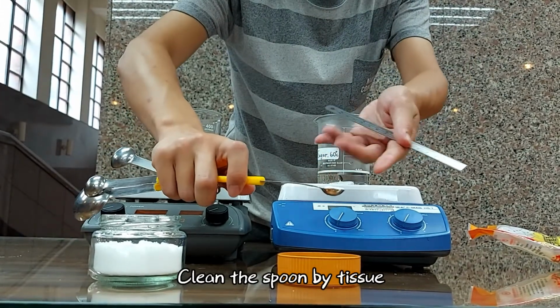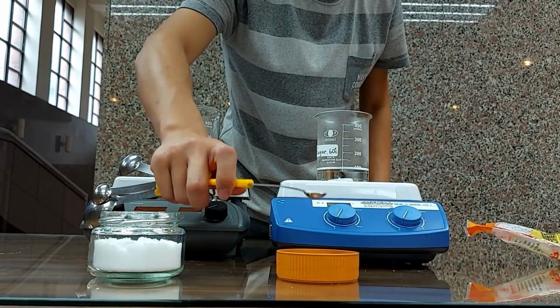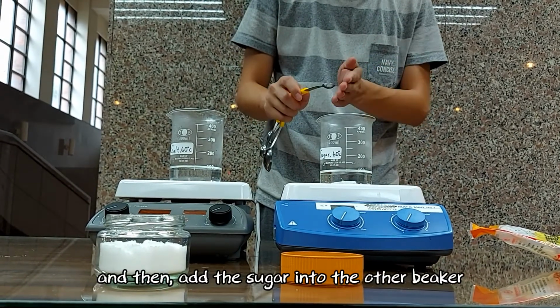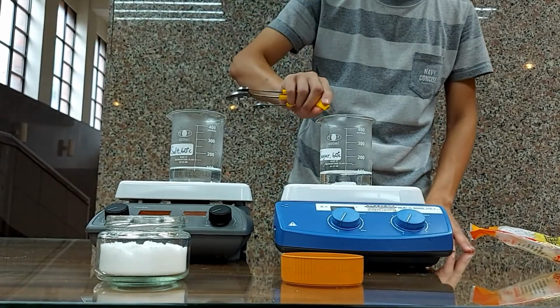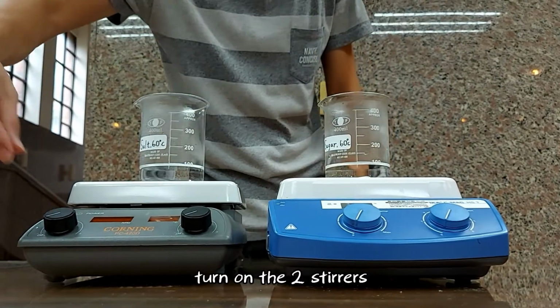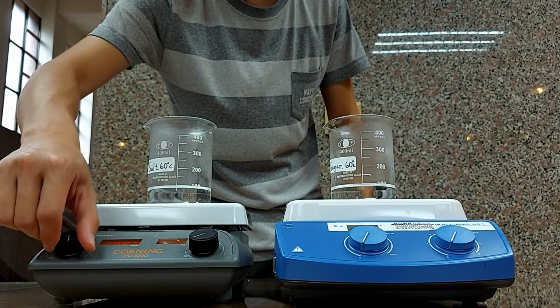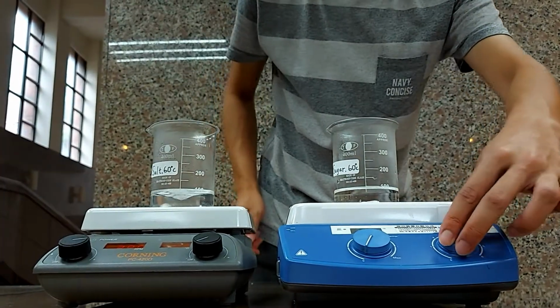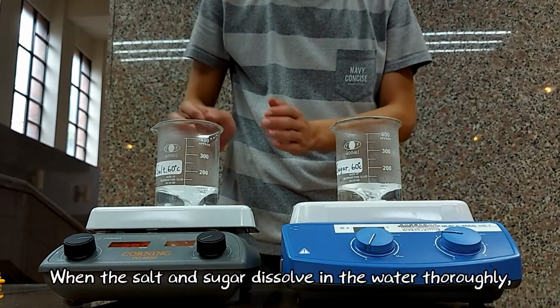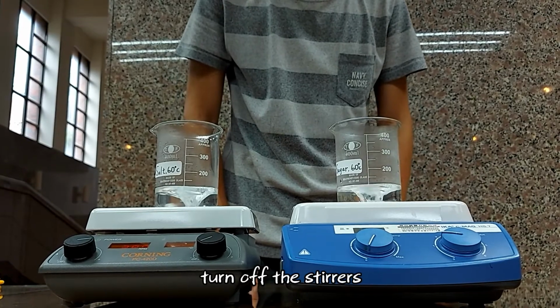Clean the spoon with tissue and use the same way to make one level teaspoon of sugar. And then, add the sugar into the other beaker. Turn on the two stirrers. When the salt and the sugar dissolved in the water thoroughly, turn off the stirrers.